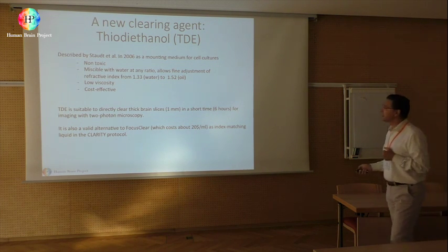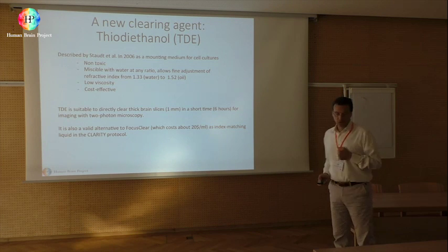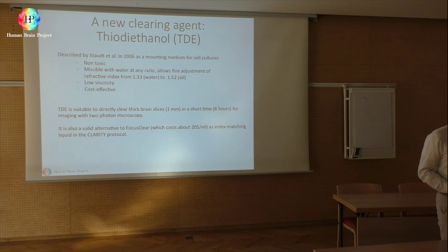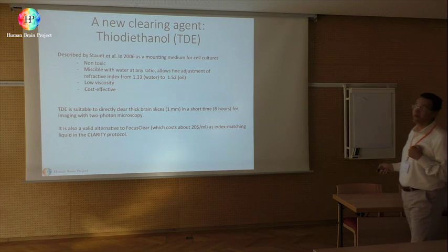And the nice thing is that if you use the other Clarity, they can take 1 week to clear the brain, while TDE is only 6 hours. But the nice thing is that it costs 200 times less than FocusClear, because this is a very, very common compound.